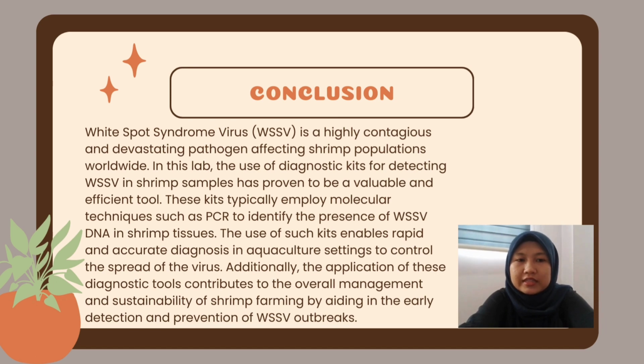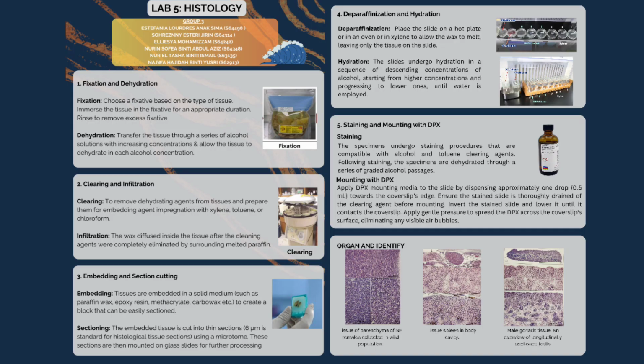the virus. Additionally, the application of this diagnostic tool contributes to the overall management and sustainability of shrimp farming by aiding in the early detection and prevention of WSSV outbreaks. That's all from us. Thank you.